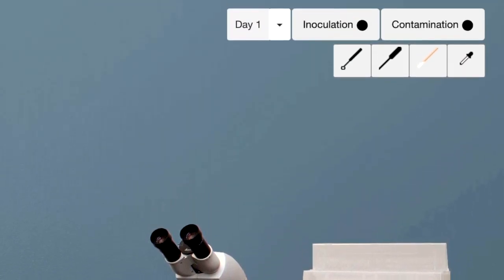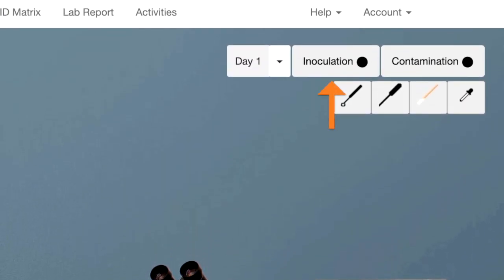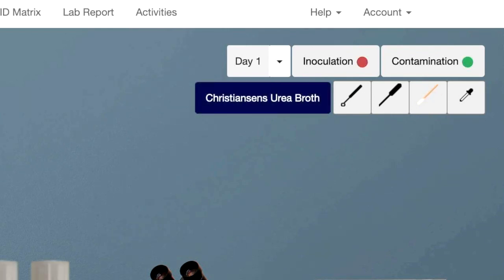You will see at the top right two lights labeled inoculation and contamination. We call these the traffic signals. They are initially black, but when you start to do a test, they will change color. If you've done the inoculation correctly, both will turn green.